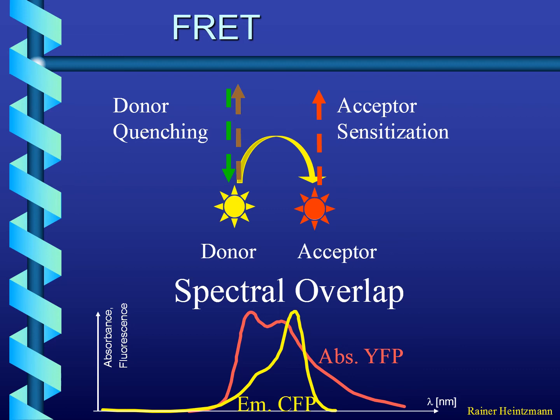This is completely not explainable if you just look at far field emission. You would have zero emission in that direction because the dipoles only emit orthogonal to their orientation, whereas the best Förster transfer you get when they are in the same line. That would not be explainable otherwise.